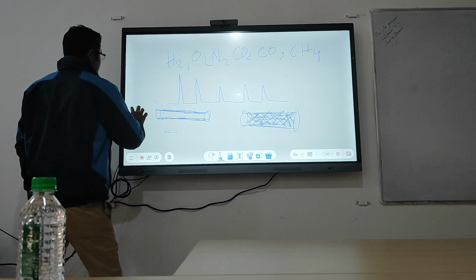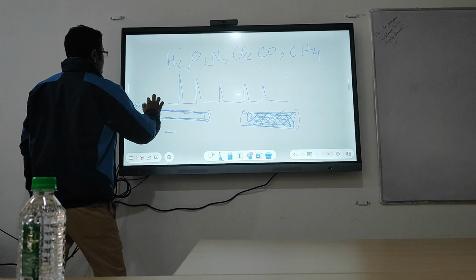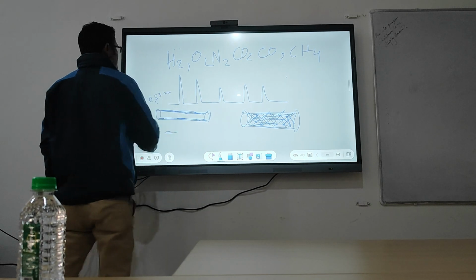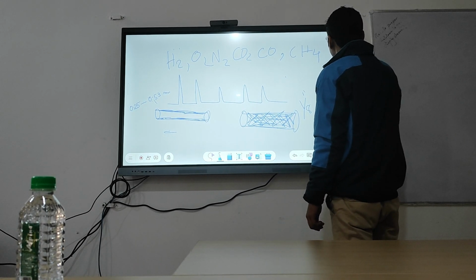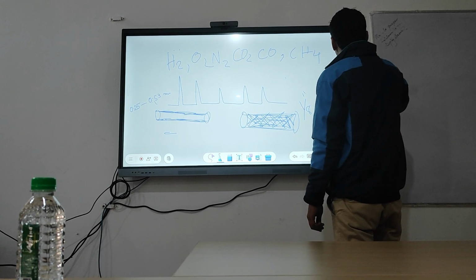This ID is 0.25 to 0.53 mm. And this ID is 1/8 inch, 1/16 inch, and sometimes 1/4 inch.